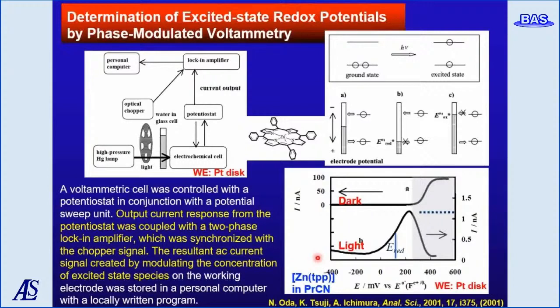Therefore, the method used here is to cut off the incoming light with choppers and record the photocurrent only at the time of incidence with the lock-in amplifiers.